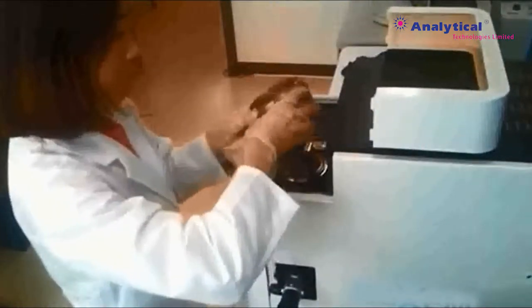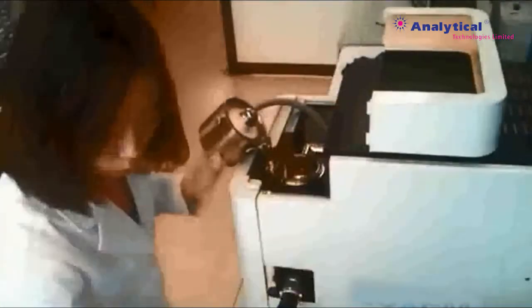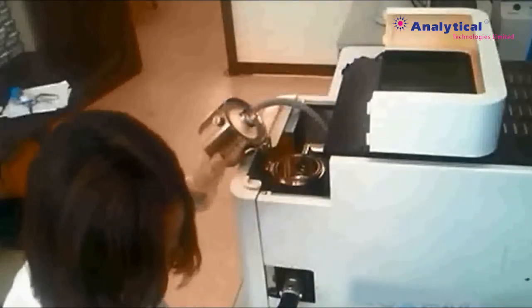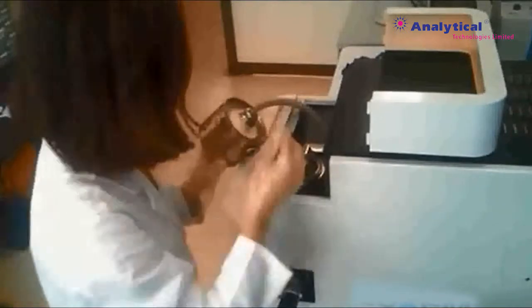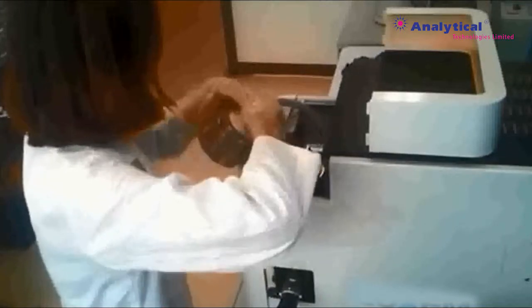Filament replacement. Open up the case and vent it. After turning to air state, open the electron gun at the top. Unwind the wehnelt protection cap counterclockwise and remove it. Remove the cylinder that has a disconnected filament by pulling it straight up. Insert the new cylinder with the new filament. Then, cover it with the wehnelt protection cap and firmly secure it. Close the electron gun at the top and pump it to make it a vacuum state.